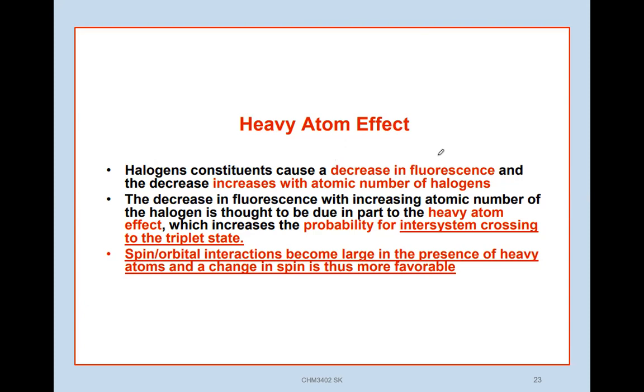It will interfere with the energy, therefore the fluorescence is affected.